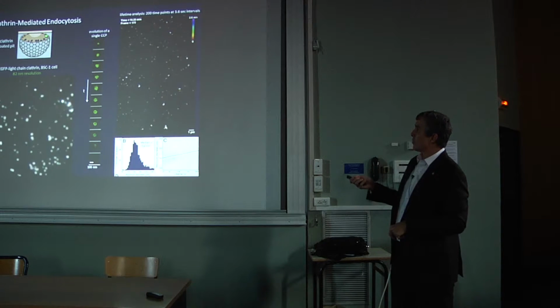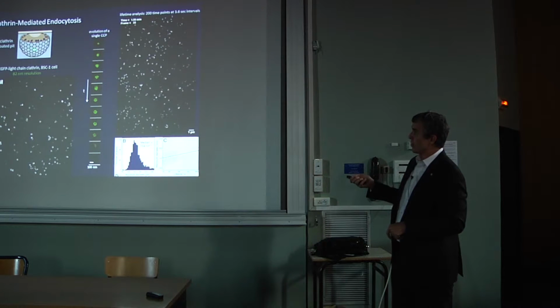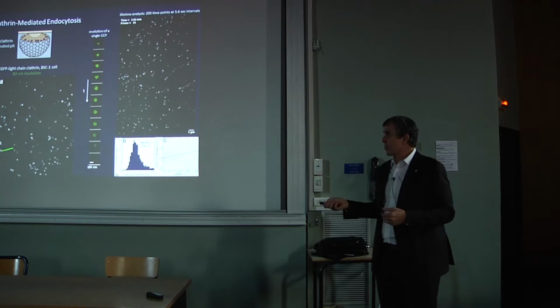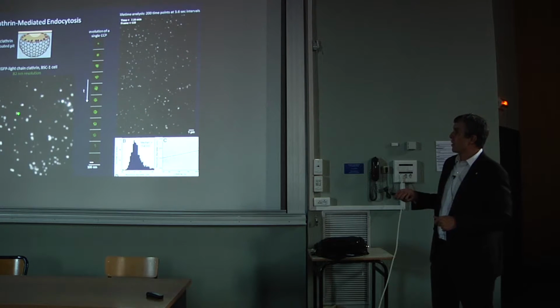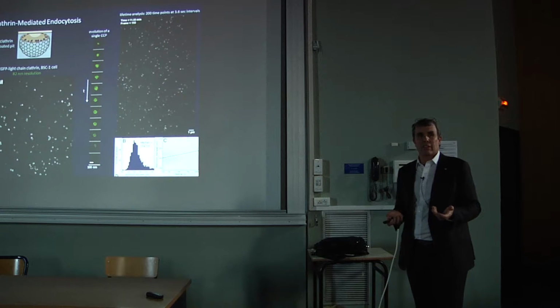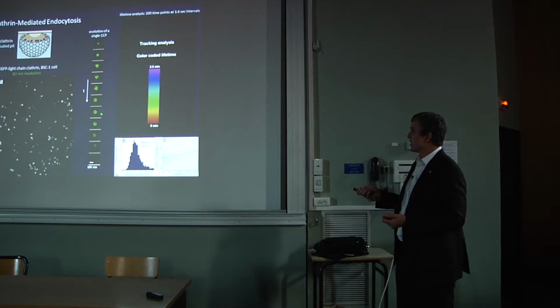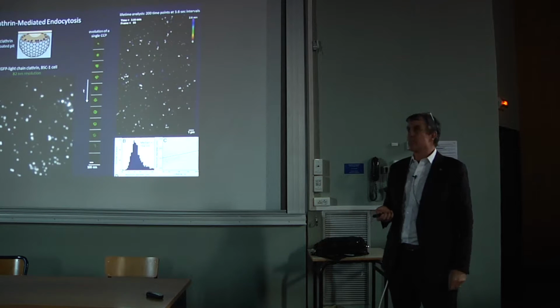So in the TIRF that we're doing here, the evanescent field only lights up this part of the pit, so it ends up looking like a ring when we're able to resolve it with the TIRF SIM. But now that we can do that, we can actually follow the entire evolution of these clathrin-coated pits from their initiation, their maturation, and their eventual pinch-off and internalization.